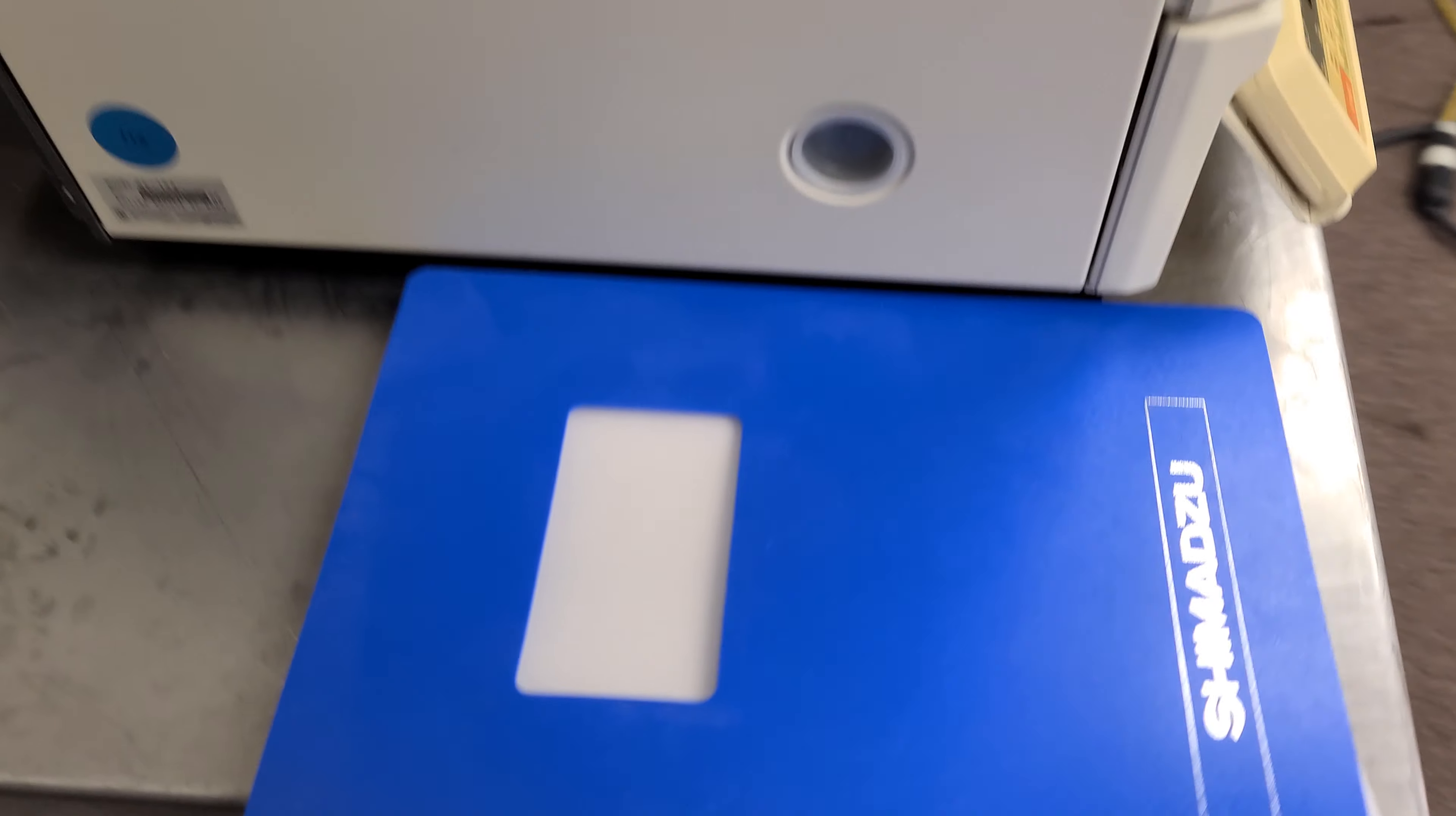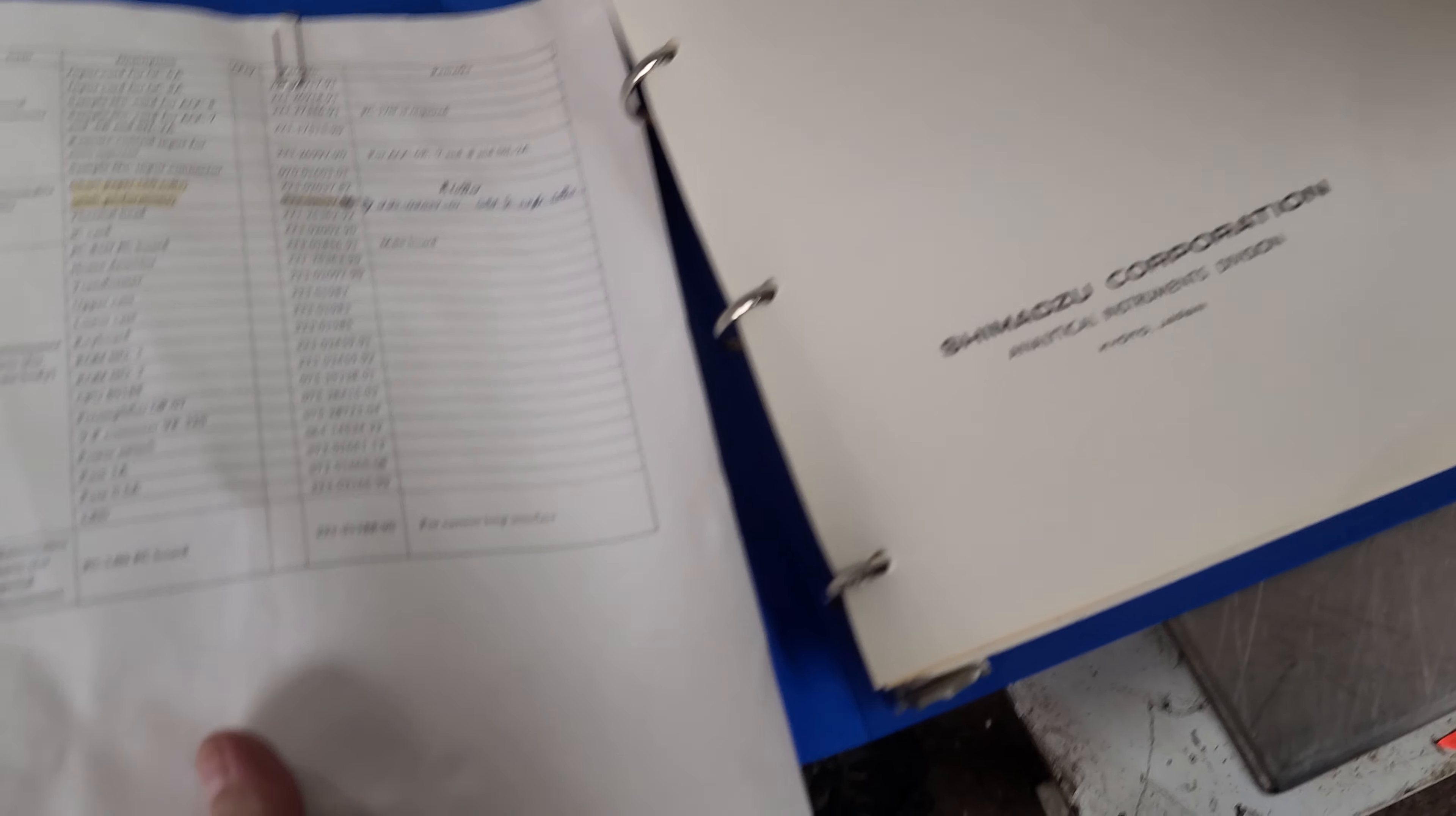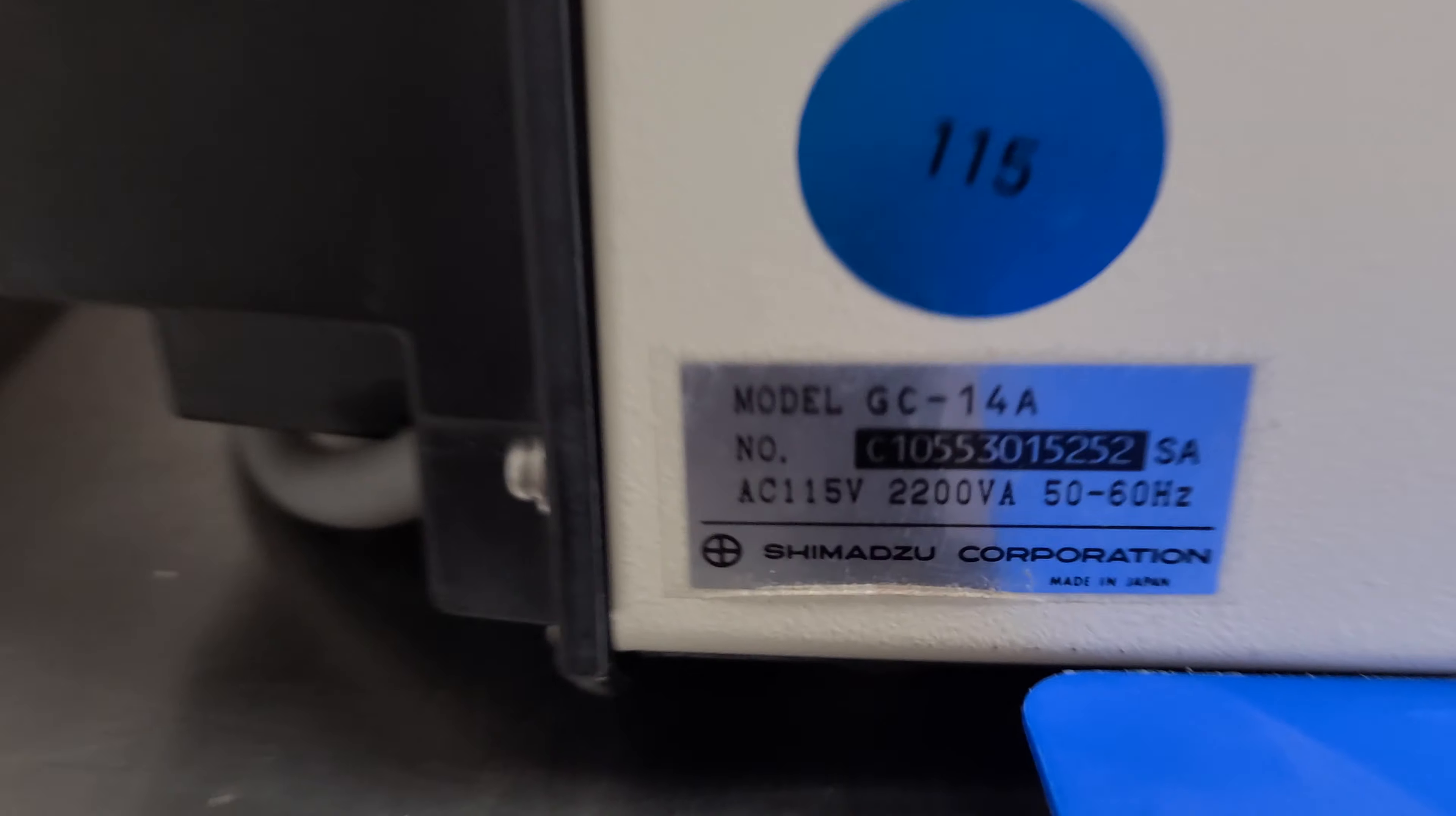That side, here is the manual for it with tons of stuff. And that is our unit here. If you've got any questions or concerns, let me know.